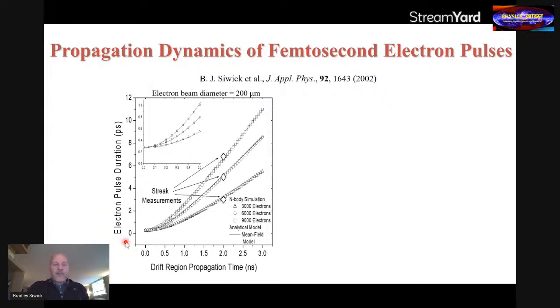So our electron microscopes work through photoemission of the electron beam. We make use of the pulse train coming out of the femtosecond laser. We shine those laser pulses onto a photocathode in the electron microscope, and every time a laser pulse hits the photocathode, we generate an electron pulse. Because, as I showed, it's quite straightforward to produce femtosecond laser pulses, at least initially, it's quite straightforward to produce a femtosecond electron pulse.